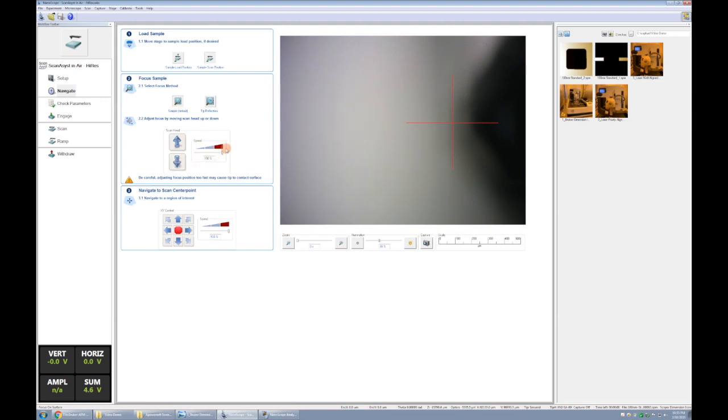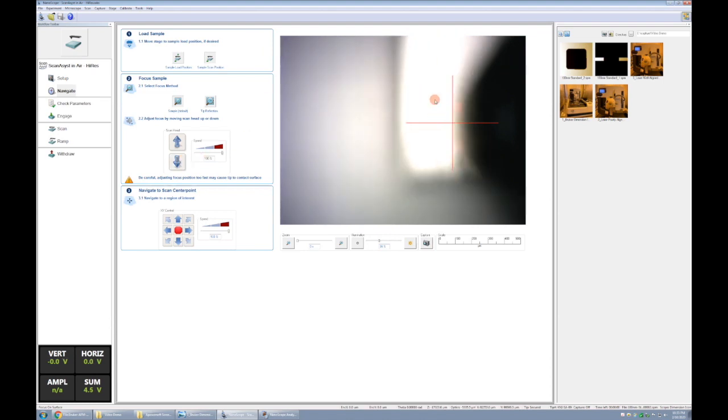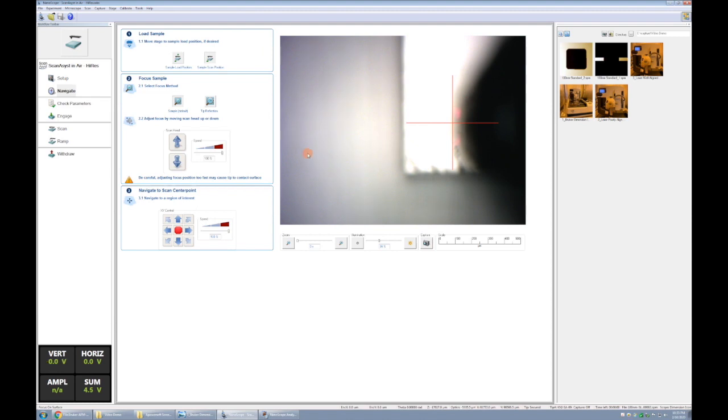Now we will drive the scan head down. It's okay to go at the fastest speed as long as you're watching visually until you see that the probe is about one millimeter from the sample. And then if we look here, we can see the corner. That's the purpose of driving to the corner. Once we see it, we can start lowering just based on visual inspection here.